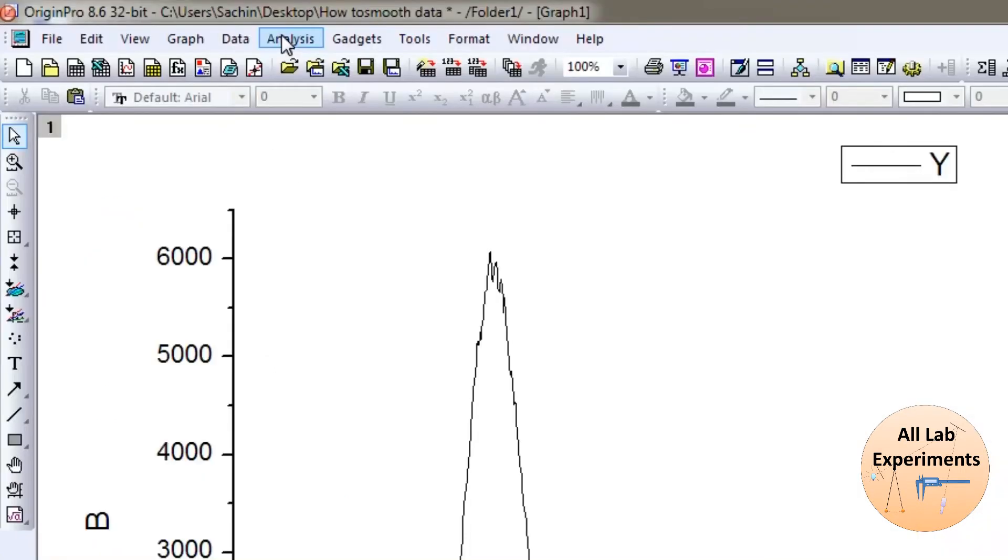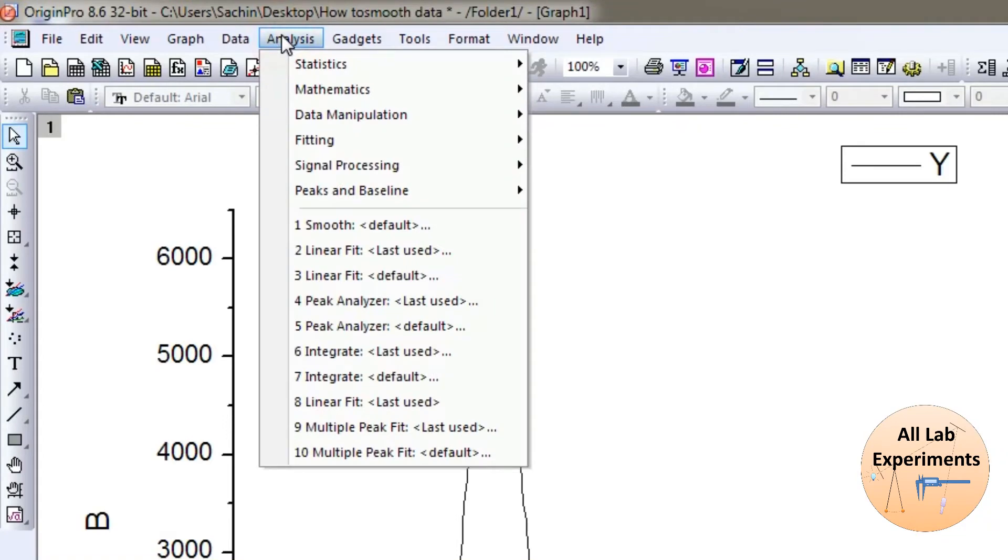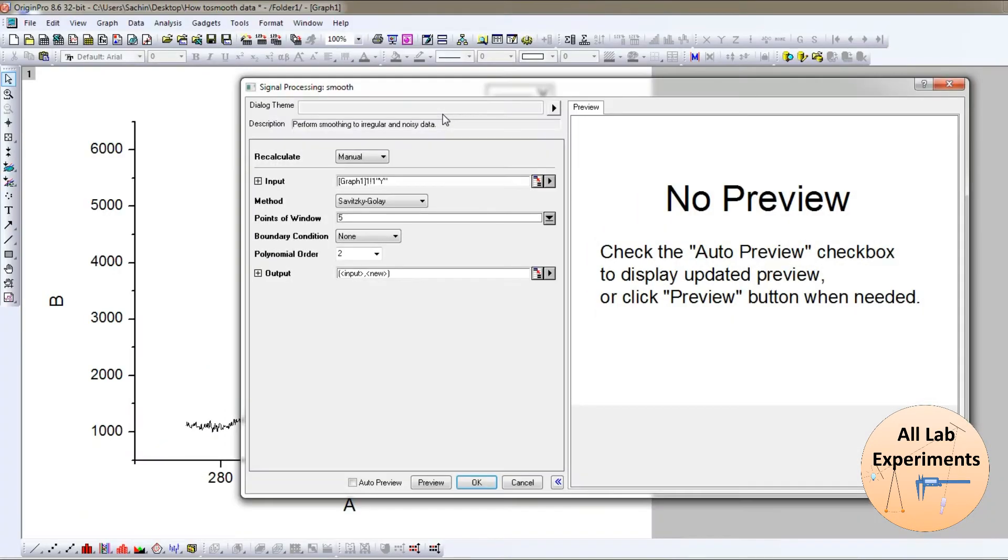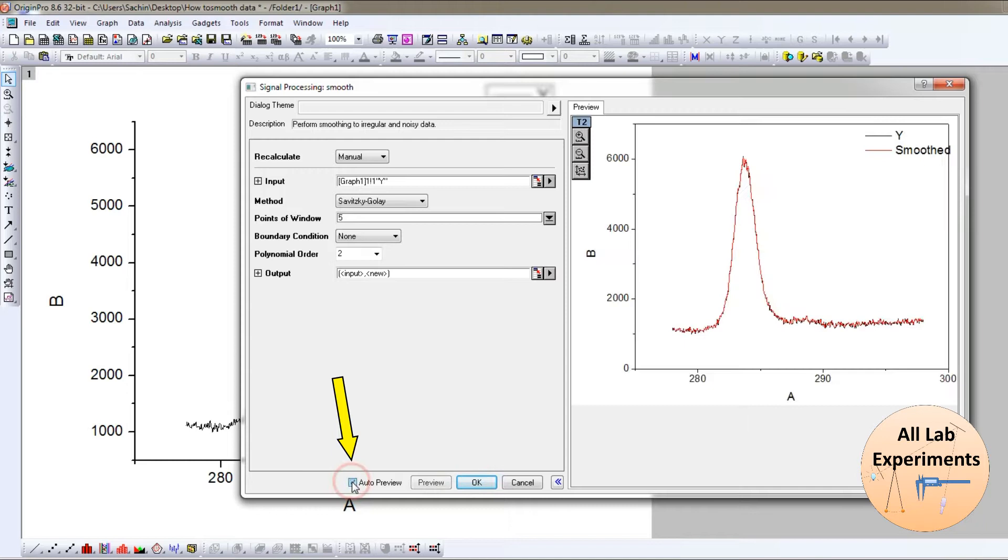Smoothing is just a five second job. To do this, first go to Analysis option, then go to Signal Processing, after that go to Smooth and then open the dialogue.